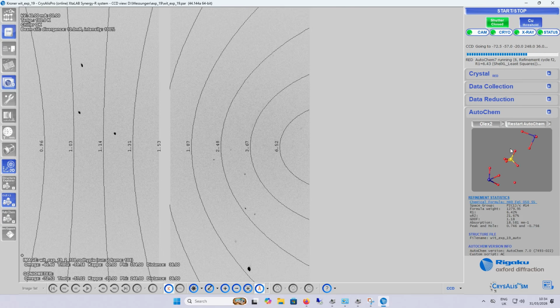Still collecting and processing it. It will take some time.